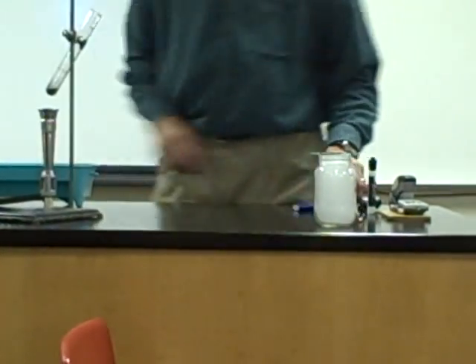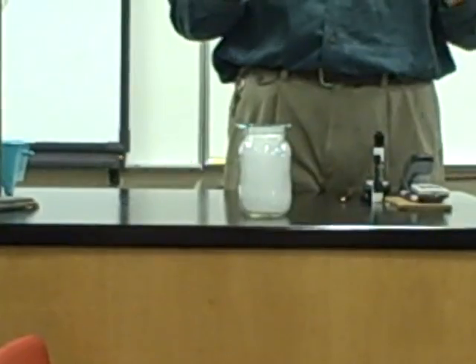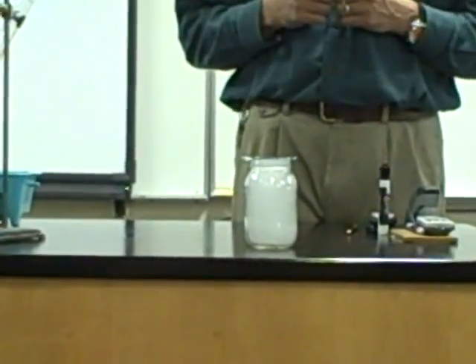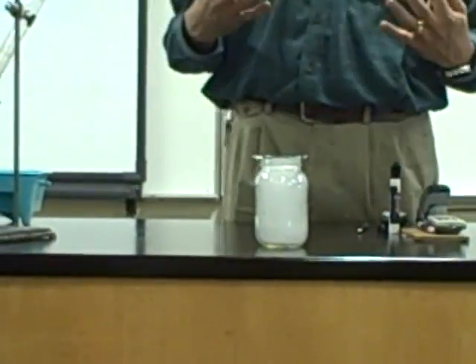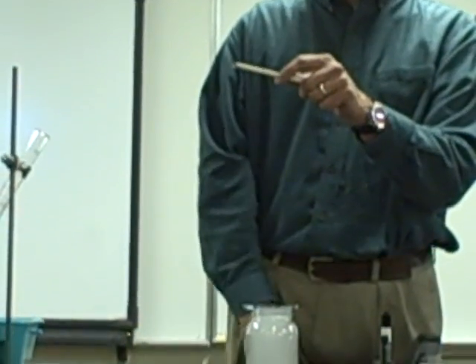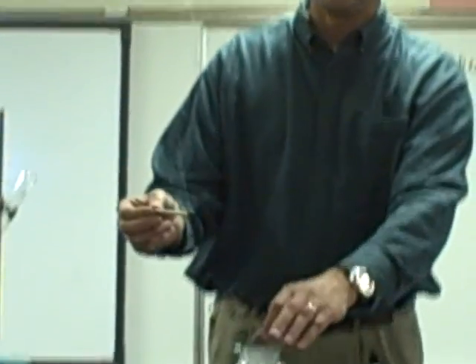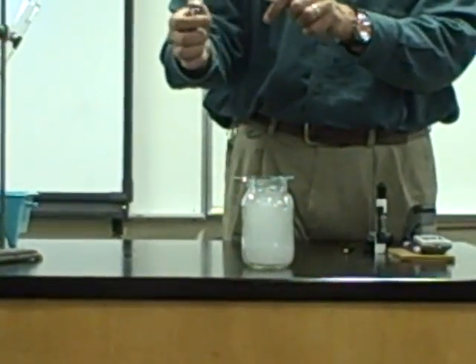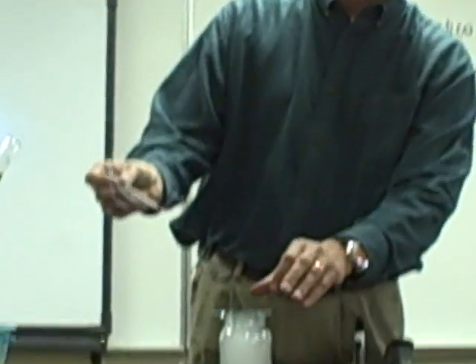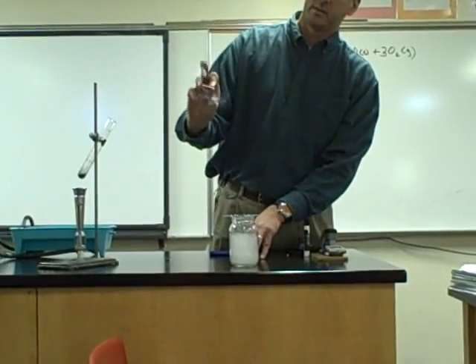A test for the presence of oxygen gas is using a wooden splint. You may have thought that oxygen gas is flammable — in reality, the gas itself is not flammable; it's the stuff that's burning in the gas. Room air is about 20–21% oxygen. In this jar, it's close to 100%. Oxygen supports combustion — things will burn faster. I'll light the wood splint, tap it out, and put the wood splint in my jar full of oxygen. I think I tapped it out — I didn't let it burn long enough. Let's try that again: tap out my wood splint, put it in my jar full of oxygen. And we can do that again. And again.